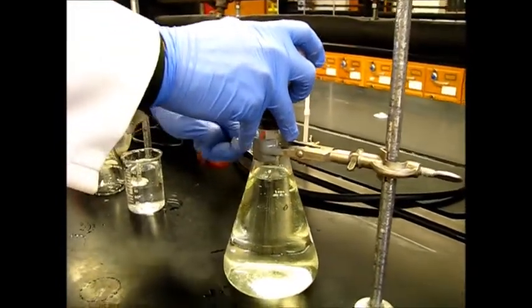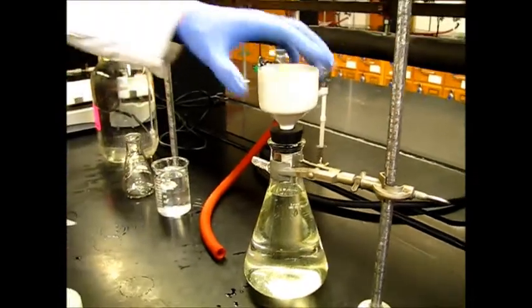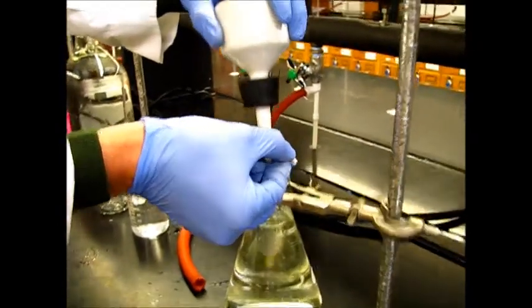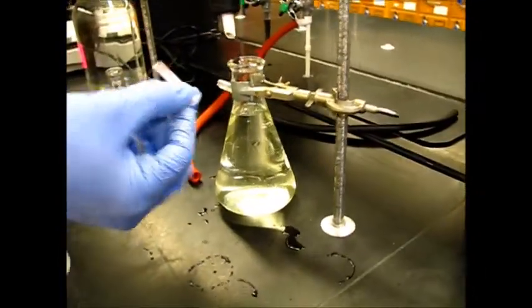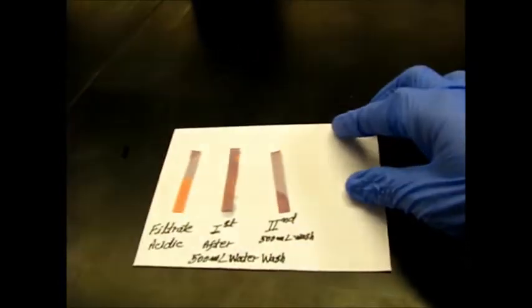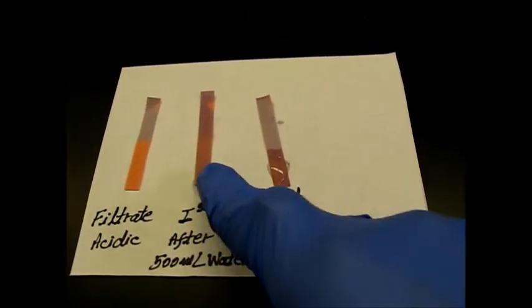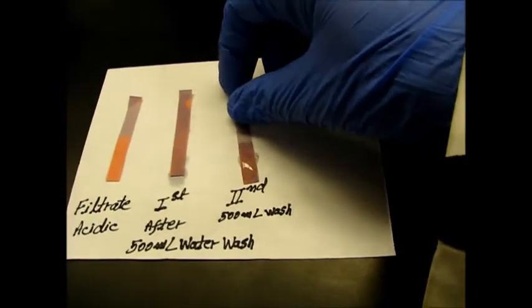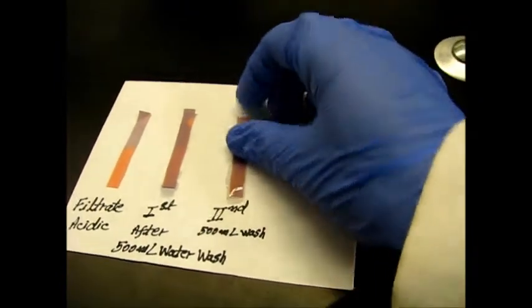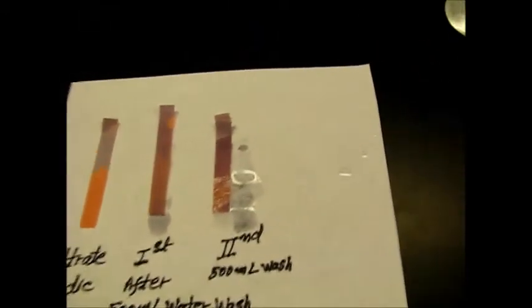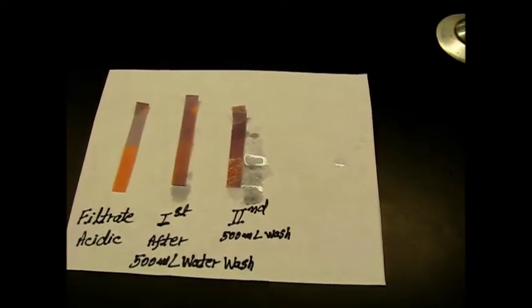This is the second 500 mL water wash and we will check the pH of filtrate from the Buchner funnel and compare with the previous one. Here you can see the difference - this is the acidic filtrate, and after the first 500 mL water wash it was a little bit pink, and this is after second wash, much better. We will give one more 500 mL and then it will be ready for crystallization.